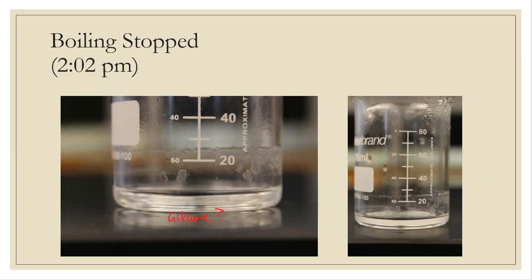Out of all of those transfer steps that we did, out of the crystal formation, the funneling, the washing, the transfers, how much alkane do I have left over in the very end? And if I look at this, I feel pretty good about myself. And the reason is because I physically can see that layer. If this was just a smear, then I would be, uh-oh, I didn't do a very good job. And you could have ended up with a smear, and that could have been due to not catching the extra filtration that came through and precipitated out in that filter flask. Look at how much crystal that was there that precipitated out.